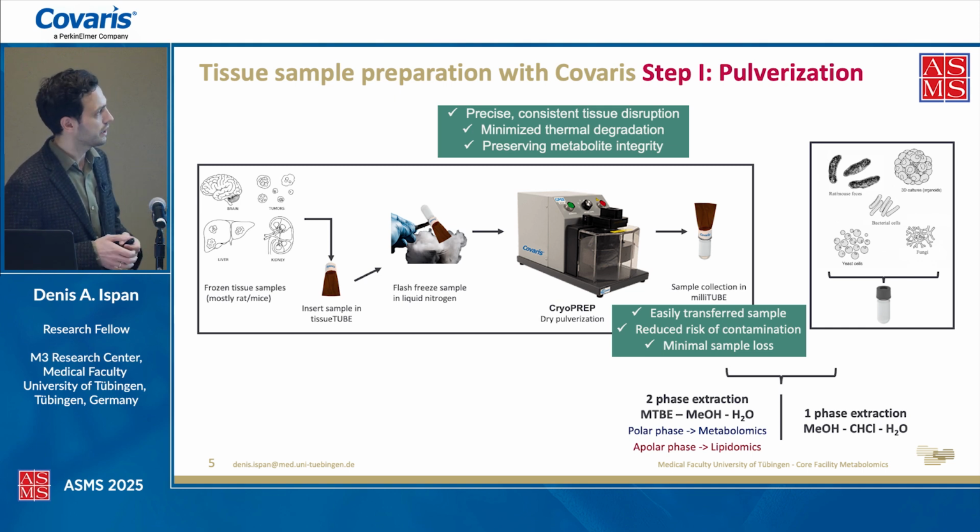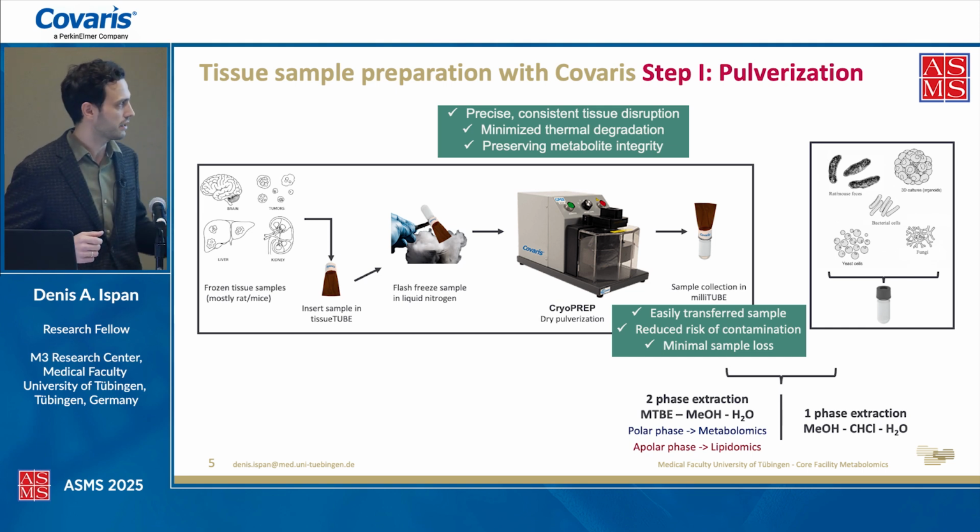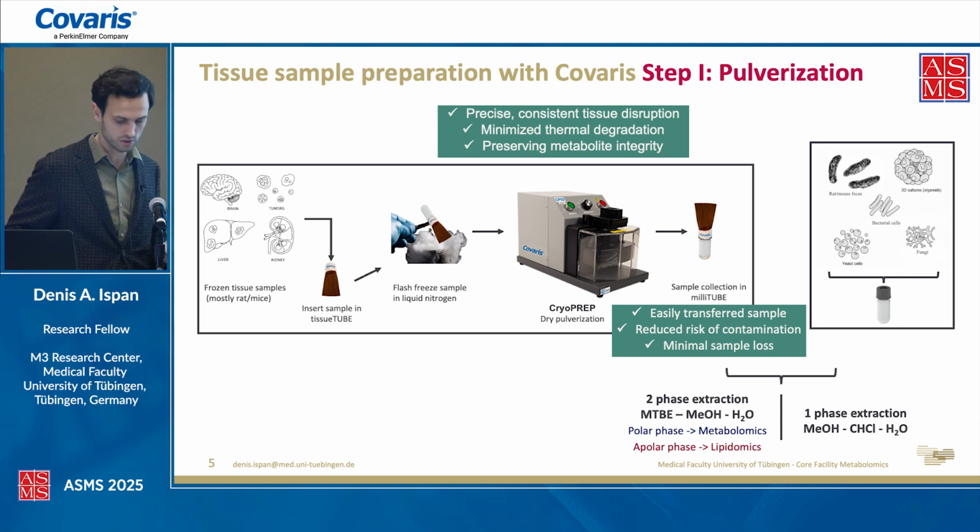After that, we do either two-phase extraction, if we want to separate into a polar phase to analyze the metabolomics and a nonpolar phase for the lipidomics. And if you want to have everything together, then we just do the one-phase extraction.